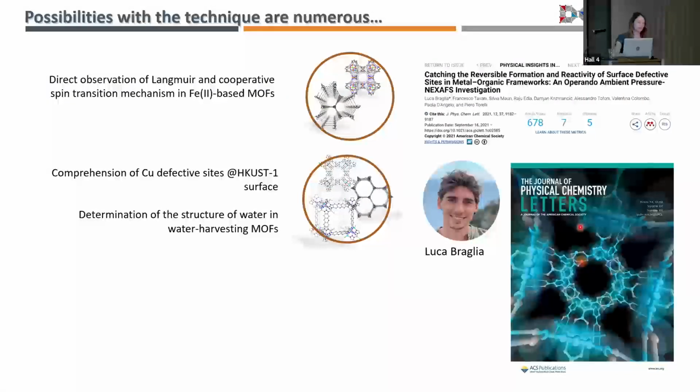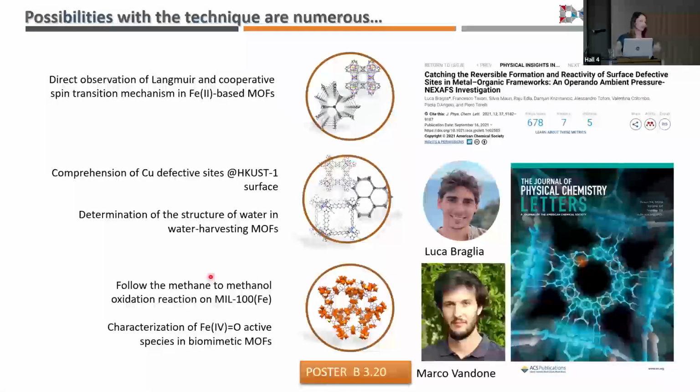Then we are dealing with more complex experiments, such as determination of the structure of water in water harvesting MOFs, or catalytic experiments, such as following the reaction steps of methane to methanol oxidation on MIL-100 iron, or characterization of elusive active species during catalytic experiments on biomimetic MOFs. Marco Vandone is my PhD student. He has a poster, and he is very good at explaining these experiments.